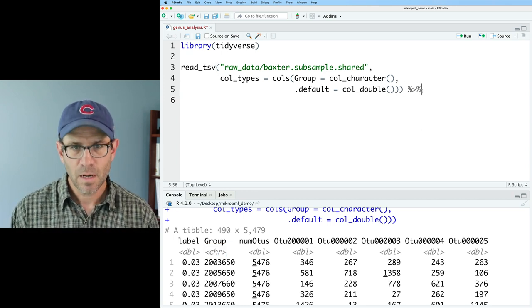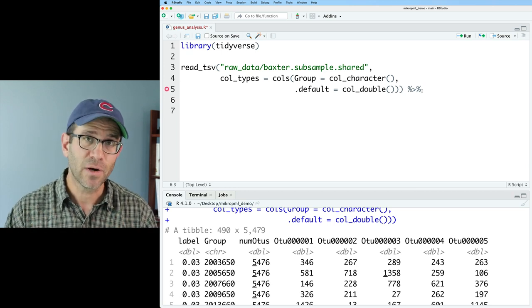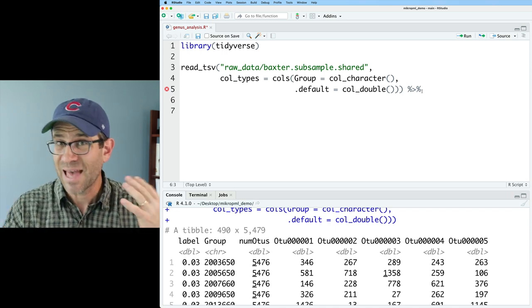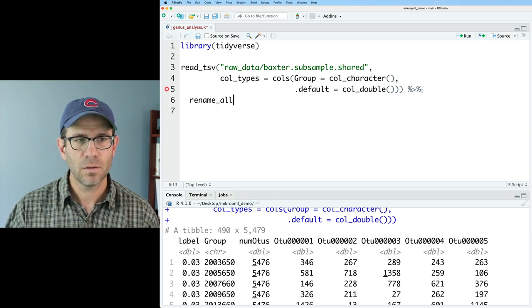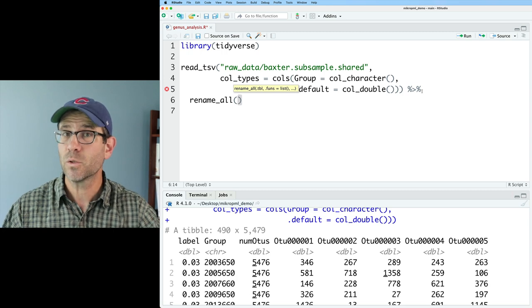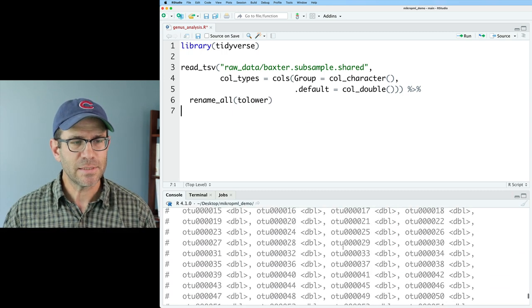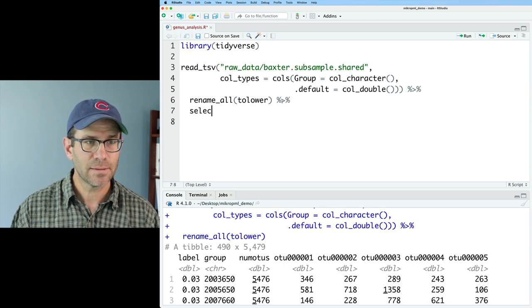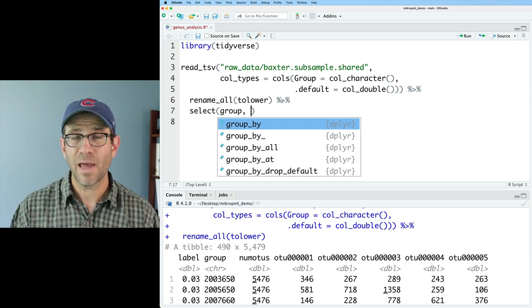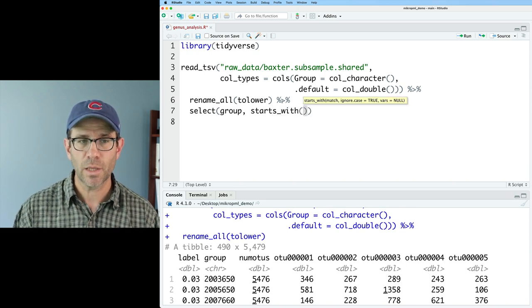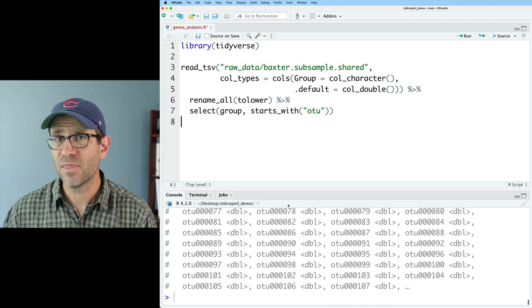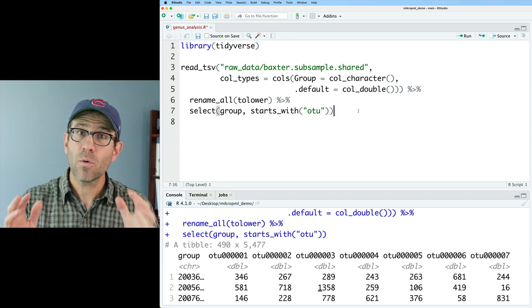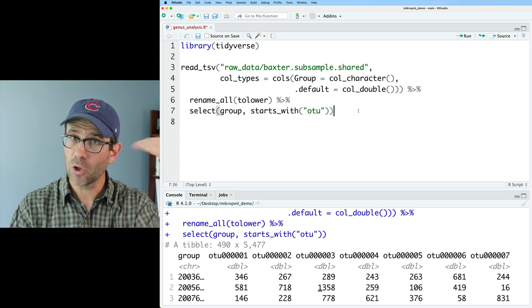The next thing I want to do to clean up my data frame is to make all of my column names lowercase — I like to do that because then I don't have to think about capitalization. So I can do rename_all and then apply tolower to all those column names. I'm also going to add a select to keep the group column as well as all of the columns that start with OTU. This should get rid of that label and numOTUs columns. And sure enough, we have our group and our OTU columns.